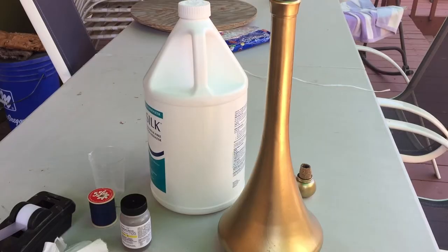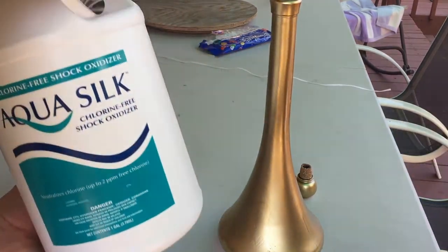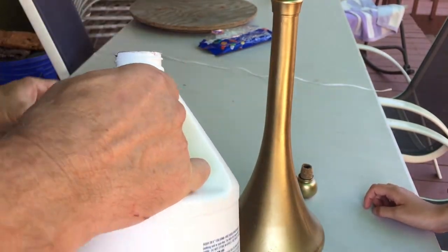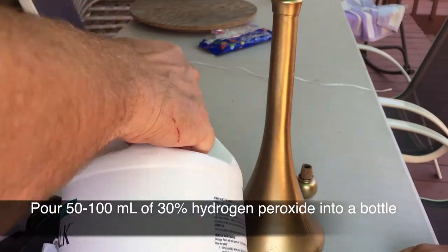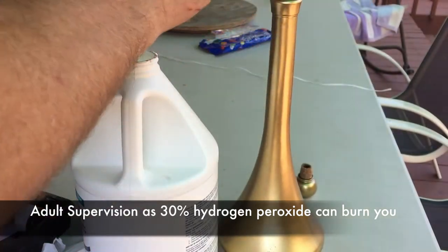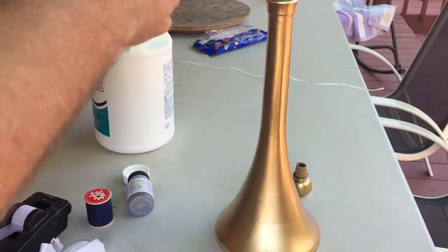To set up genie in the bottle, you need to put 100 milliliters of 30% hydrogen peroxide — I got it at a pool supply store. This stuff can burn you. The household stuff is 3%; this is 30%, so be very careful putting it in. Once you put this into the bottle — it could be any kind of bottle — I'm using a genie bottle, but it could be a wine bottle. I like to paint it gold to give it the effect of the genie in the bottle.